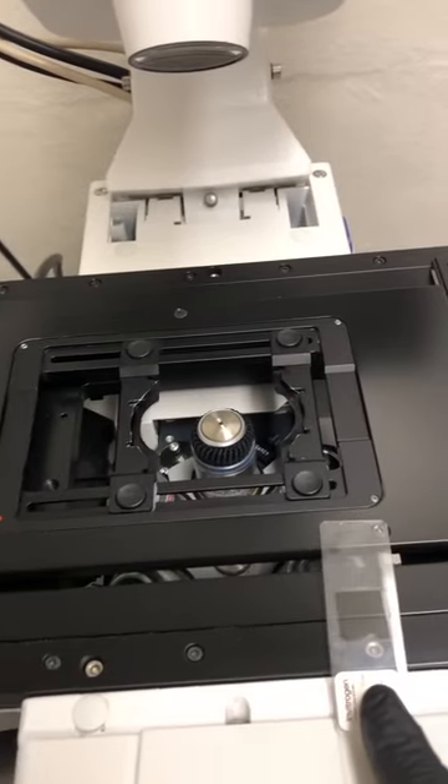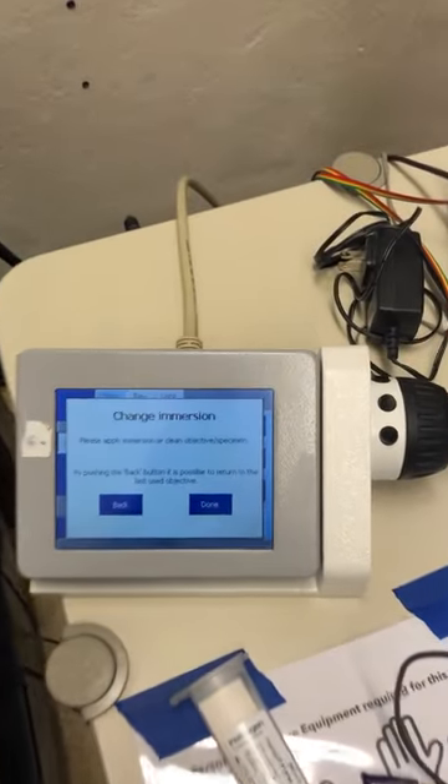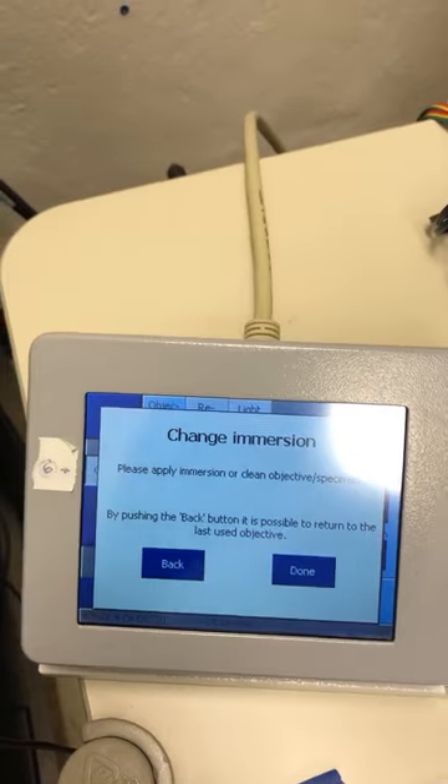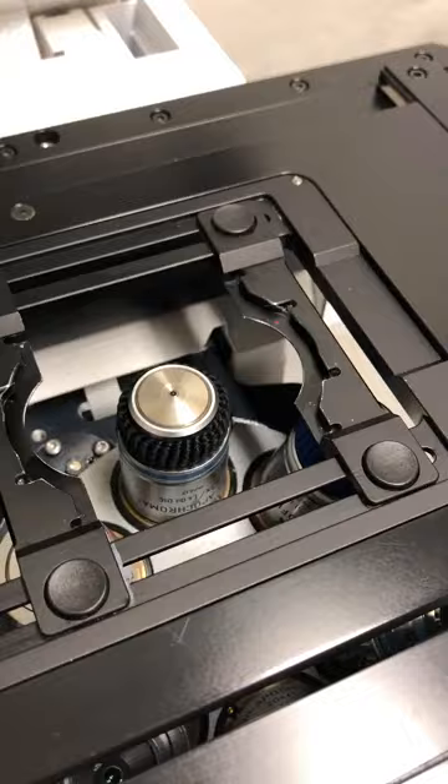As you can see, I've removed the sample and switched to the 63x oil objective by pressing the proper button on the touchscreen. When I did, it says 'change immersion - please apply immersion or clean the objective specimen.' This is relevant to us because we just switched this objective and we need to put oil on it.